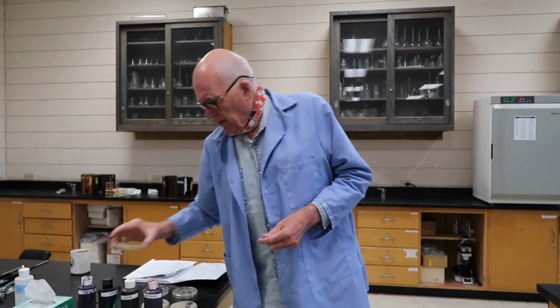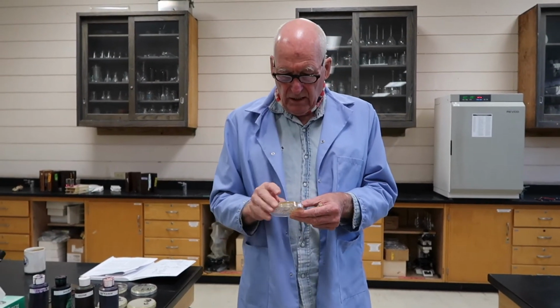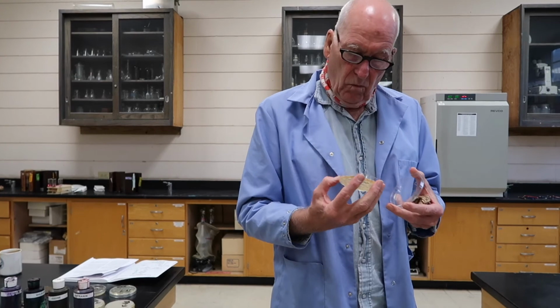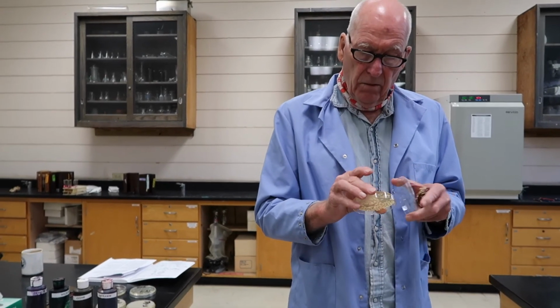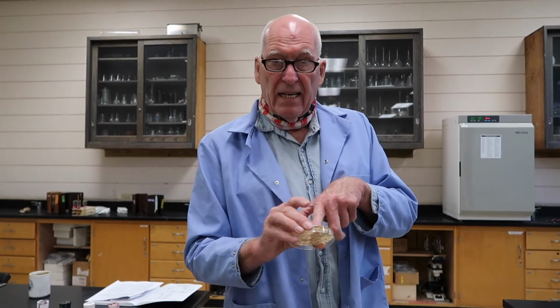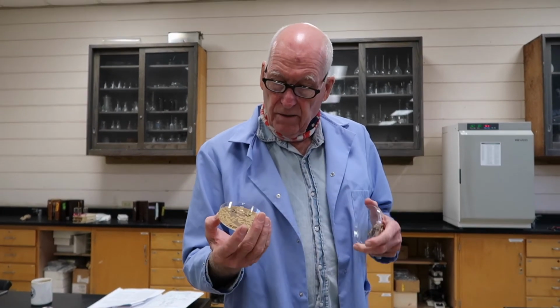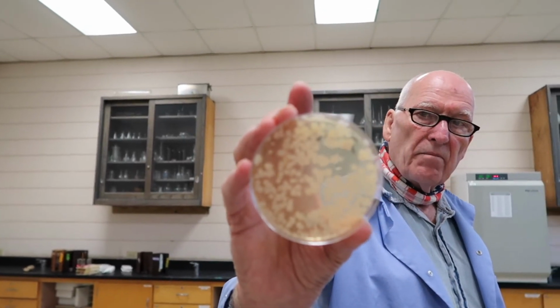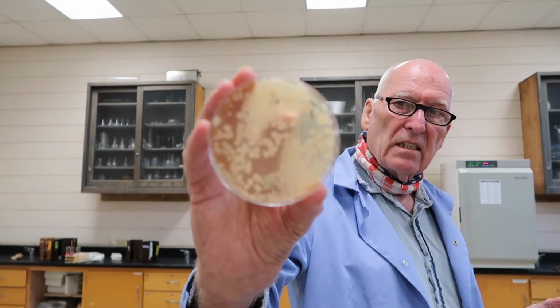And then another thing that we found, this is T2, and this media is for lactic acid bacteria. This is 2 days of incubation. This is a -2, 1 to 100 dilution. What you're seeing here is all yeast, except the little tiny ones in the background.